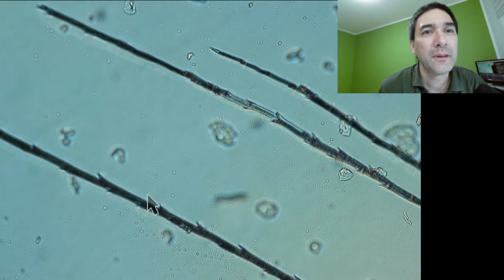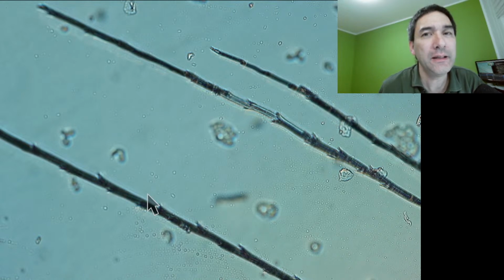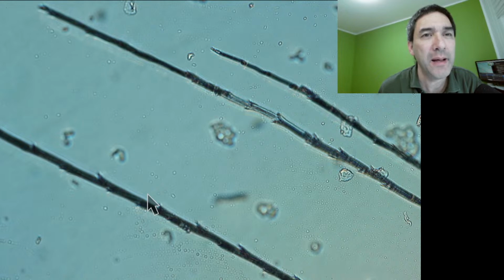Maybe I can put a microscope camera into an iPad. I think there must be certain adapters. I know I used to have an iPad many years ago.